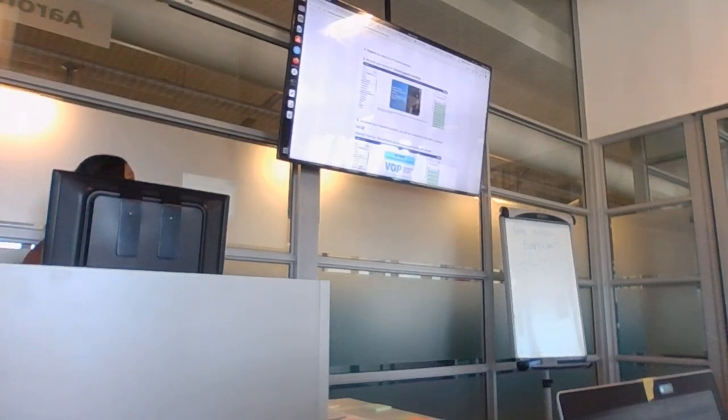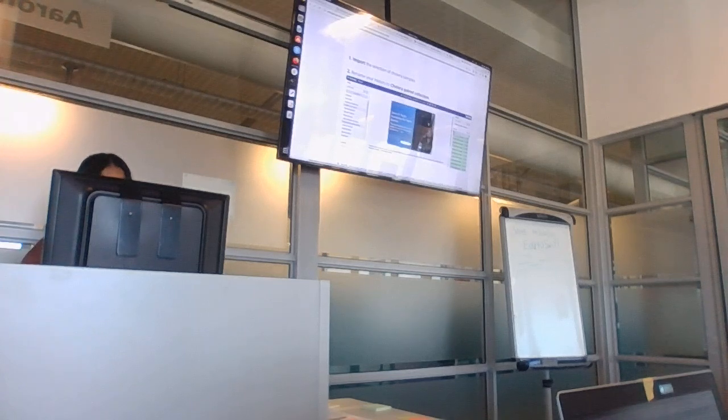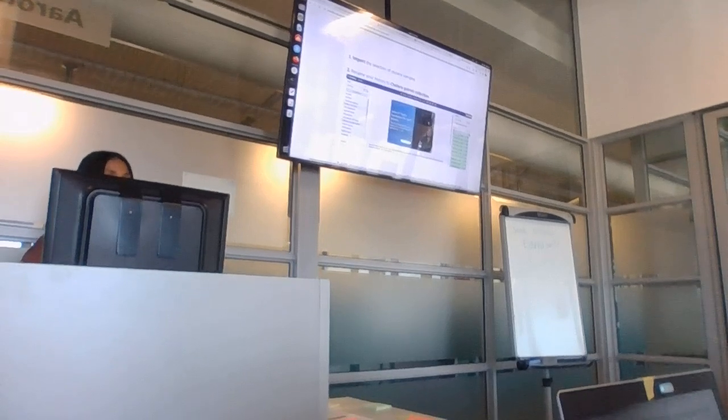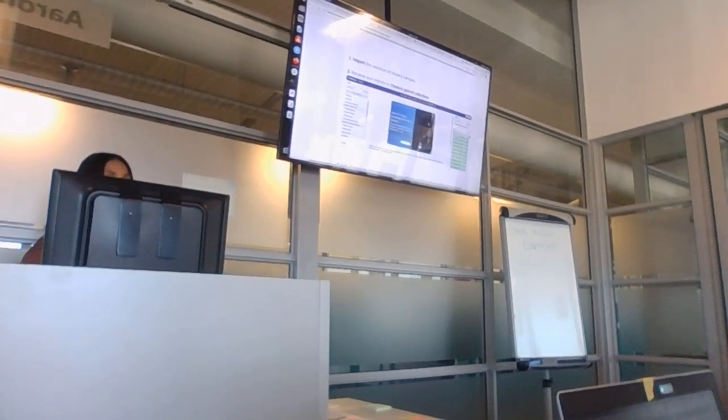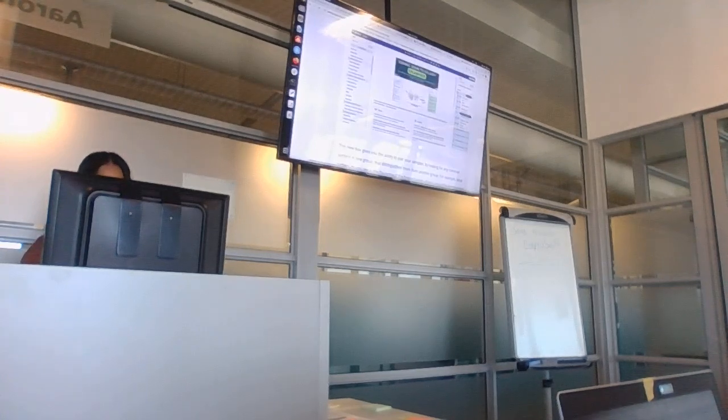There's a box here in your Galaxy, a blue box, you can see it's highlighted. Click on that to unclick it. Then you will see on the right hand side a select all will appear. Click on select all on the drop down and scroll to the bottom to where it says build list of dataset pairs.